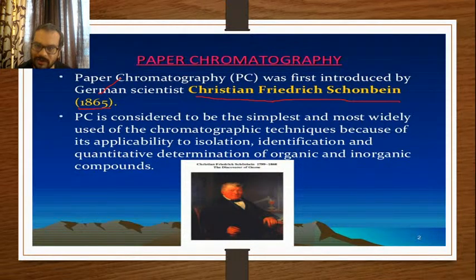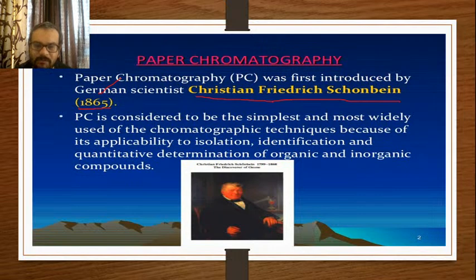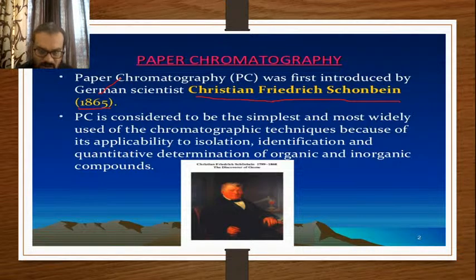That's why the term is called chromatography. Chroma means color. Color pigments that were separated historically gave chromatography its name or origin.